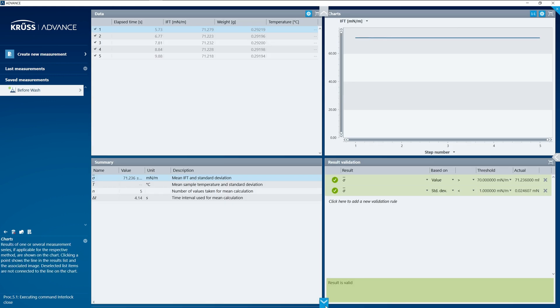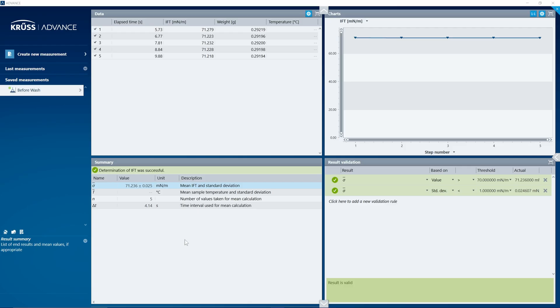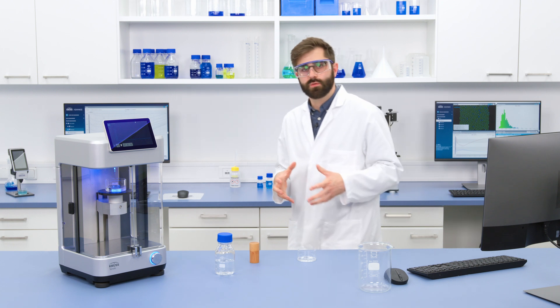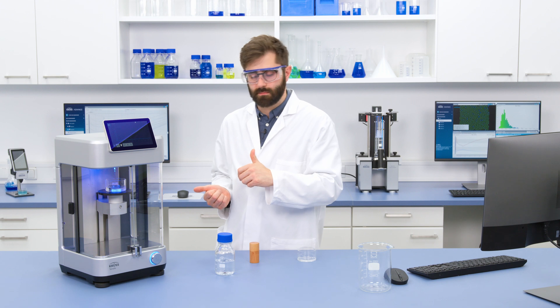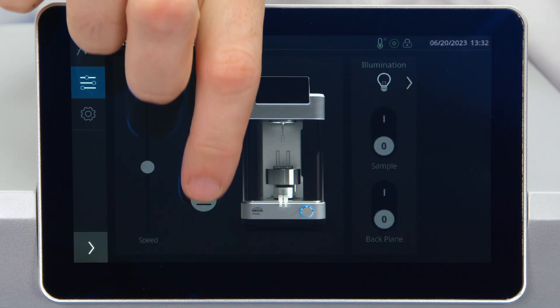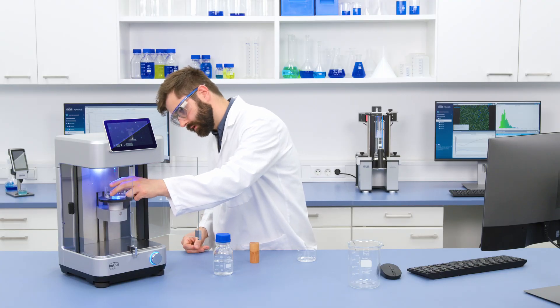Now that the measurement is finished, we have a summary on the left showing the mean surface tension of my water is 71.2 mN/m. On the right I have a validation step: I've programmed that my water, which by literature value should have a surface tension of 72 mN/m or more, must be higher than 70, and the standard deviation must not be greater than 1. Both indicators show green, so the water has passed both checks. I can now take out the sample, move the stage down, and remove the water — but I'm keeping it because I know it's clean.